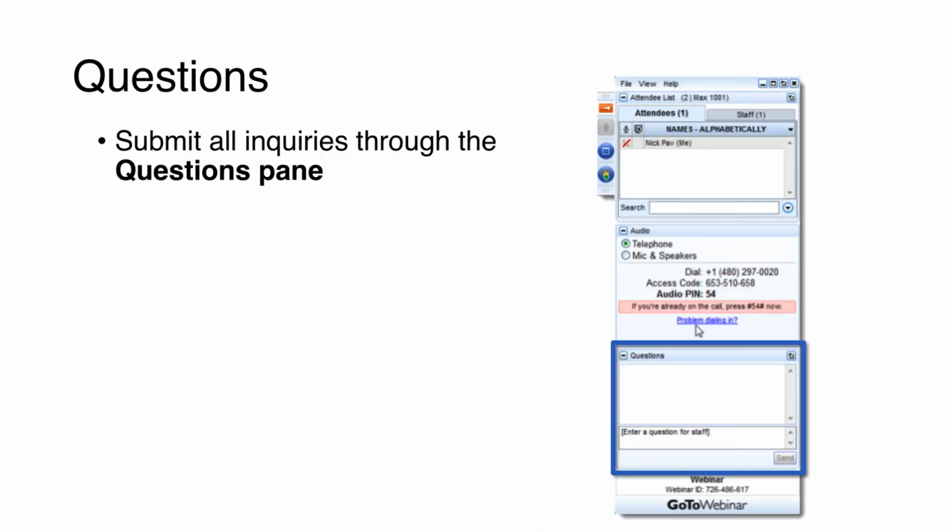Charlie, do you have a standalone data storage and computational facility dedicated to cryo-EM that's separate from the TSRI institutional facilities? Yes, good question. Yes and no. Our facility has been running for years. We have multiple storage options available to us. The main storage here at TSRI is shared amongst the whole institute.